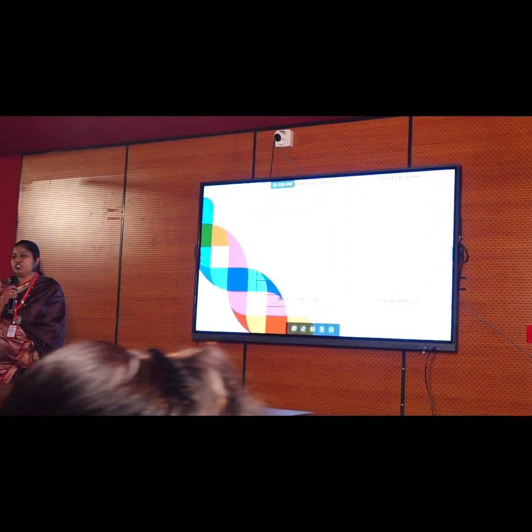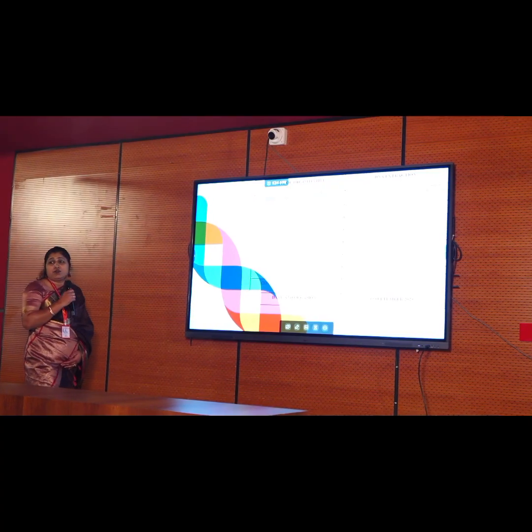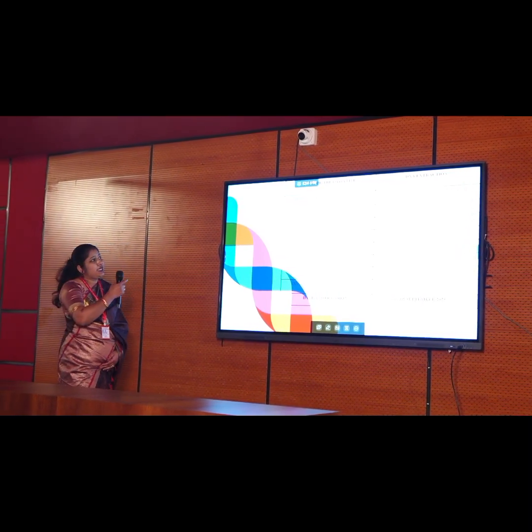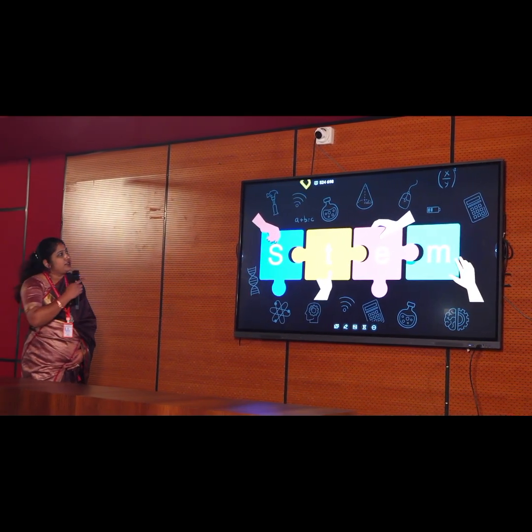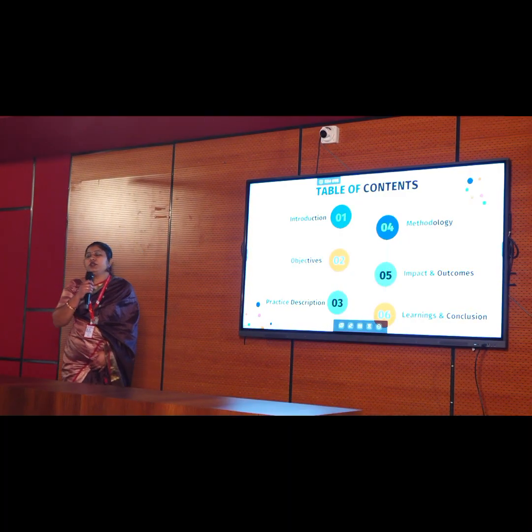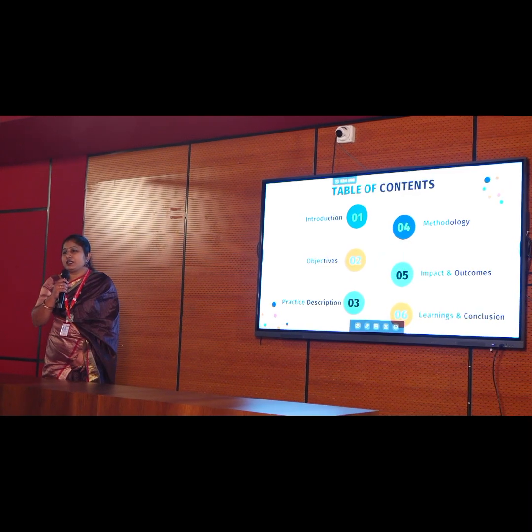It's myself Archana Patil from Patil Central School Halga, and it's a pleasure to present a case paper on STEM DLD over here. The topic which I have selected, the initiative which I have taken, is DNA extraction from the different plant sources. It is something which I have selected on a hands-on, practical basis.